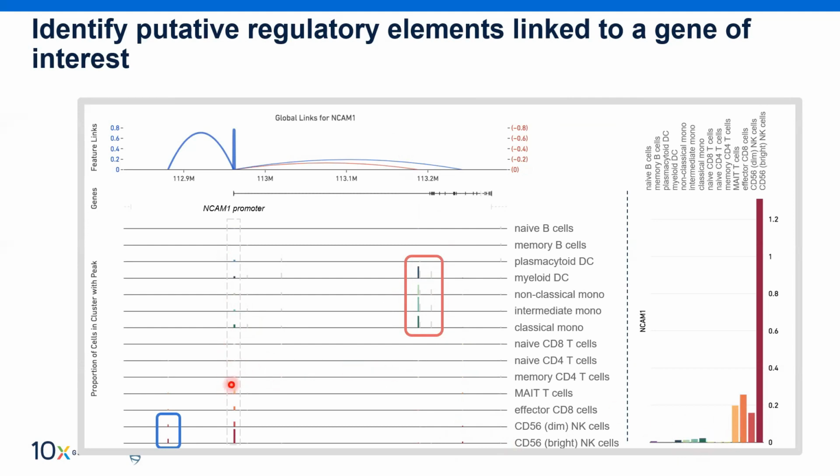So the cell has to be opened up for the NCM1 promoter so that gene expression can happen. In this way, you can do more analysis of the data, and whatever gene you are working on, you can find out how its regulatory elements are arranged or captured when doing the ATAC plus gene expression workflow in a more comprehensive way.